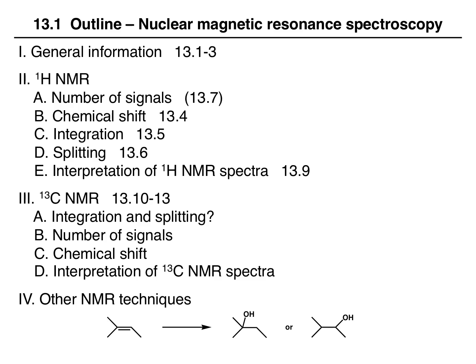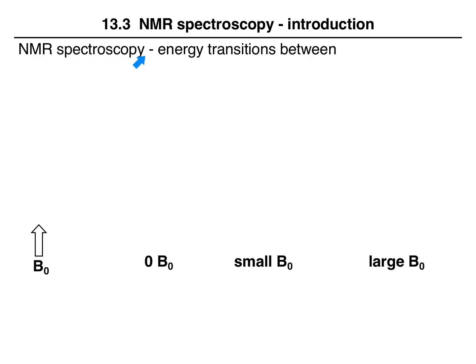In this video, we are going to continue our introduction to nuclear magnetic resonance spectroscopy, and we'll be looking at some general information to try to understand the basic principles behind NMR. Now, as we talk about spectroscopy, we are thinking about the interaction of energy with matter.